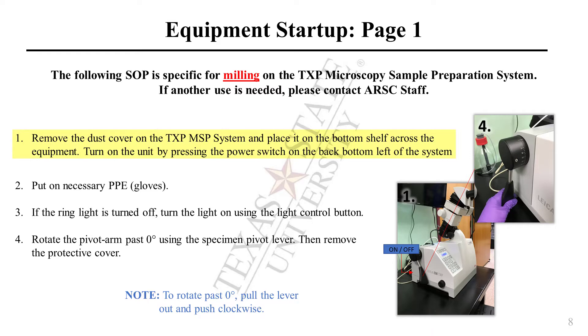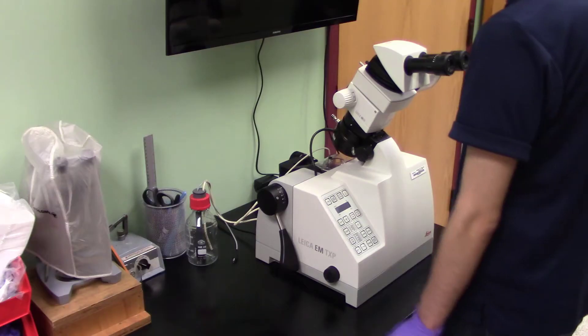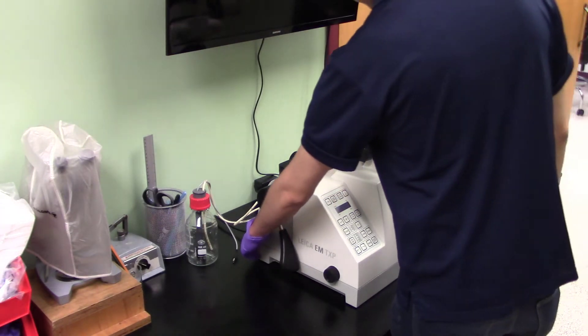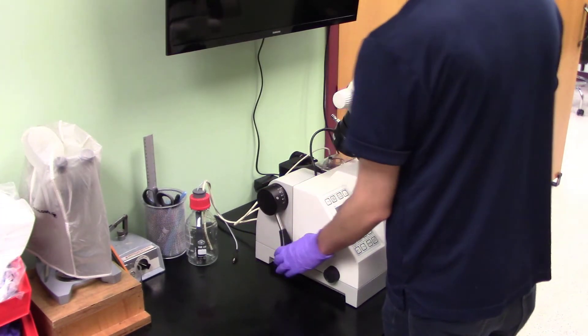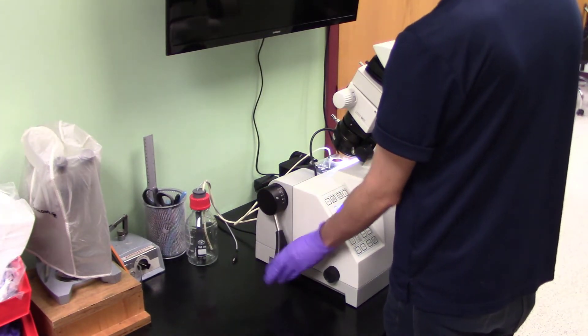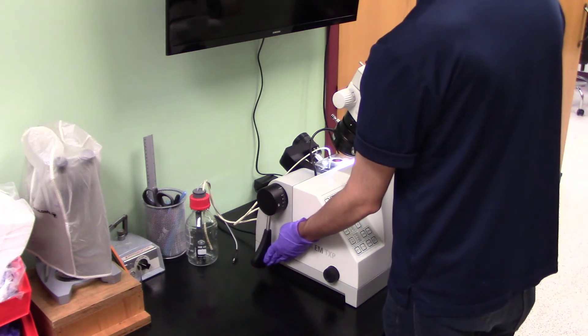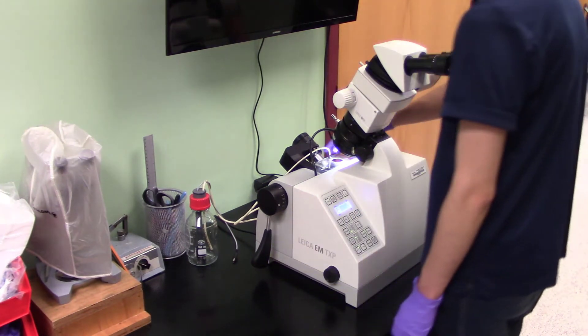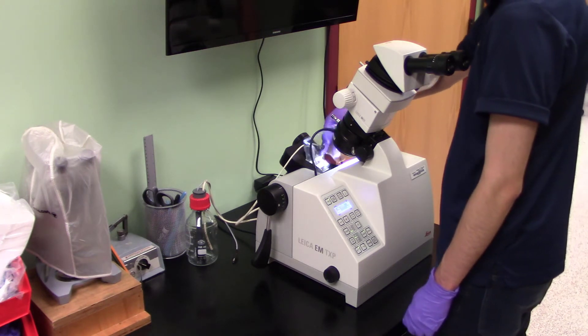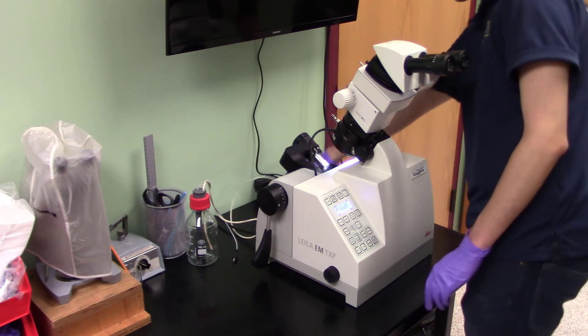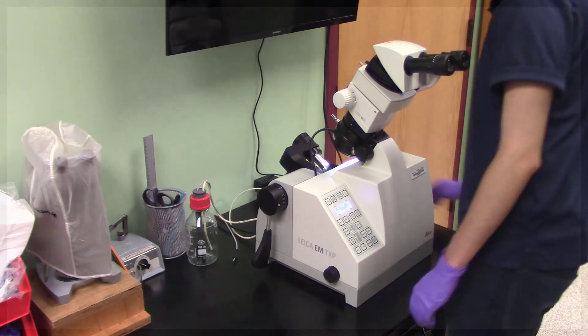To get started, remove the dust cover on the TXP MSP system. Turn on the unit by pressing the power switch on the back bottom left of the system. Put on the necessary PPE and rotate the pivot arm past 0 degrees using the specimen pivot lever. Then remove the protective cover.